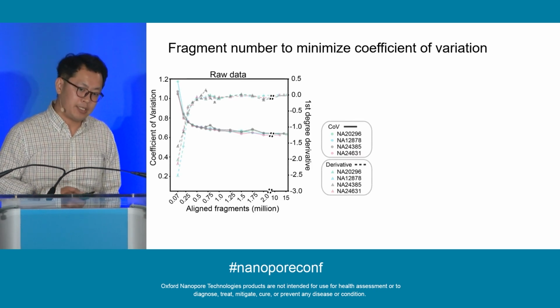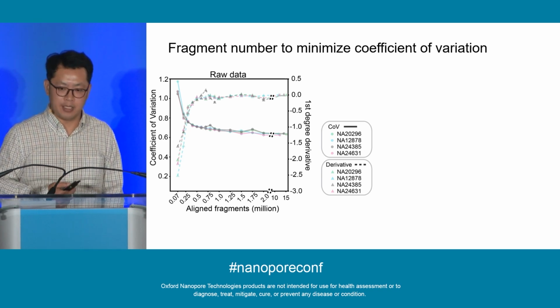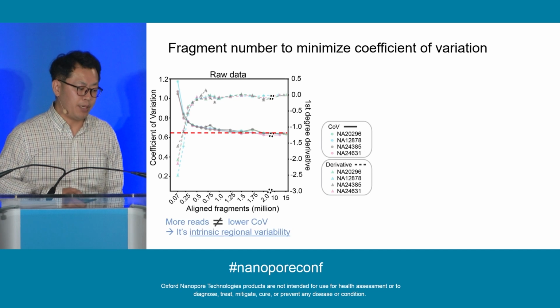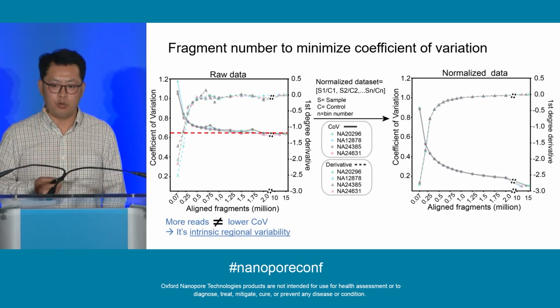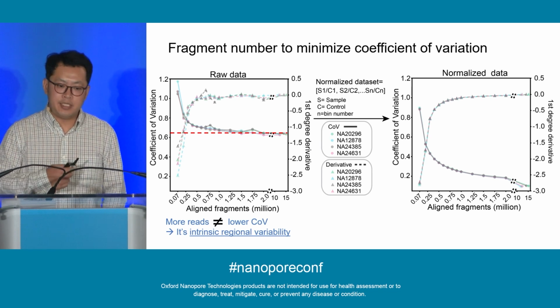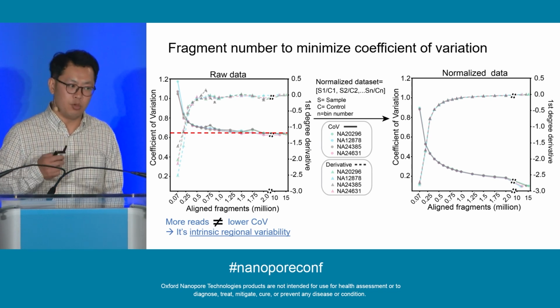So we asked, can we normalize to some predefined controlled genomic DNA? We did that, and by doing so we are able to lower the coefficient of variation to 0.1 to 0.15. At this level, we will be able to reliably assess the quantitative changes of those smaller amplifications.